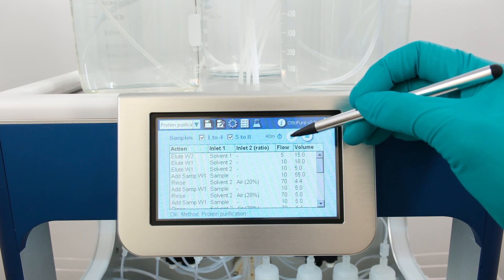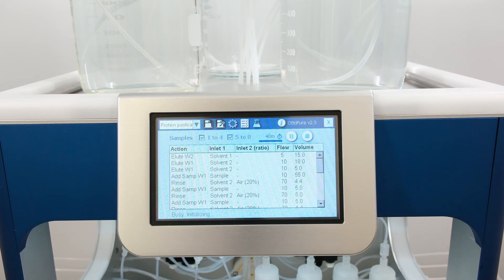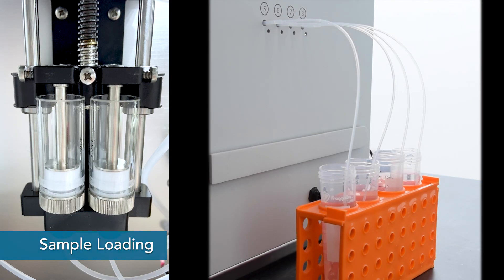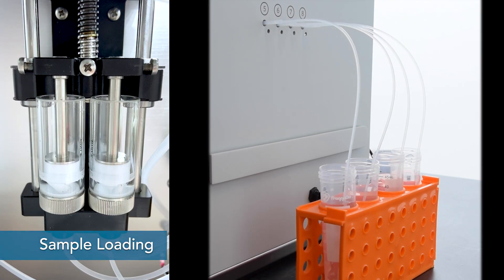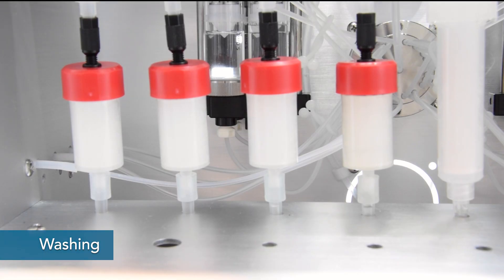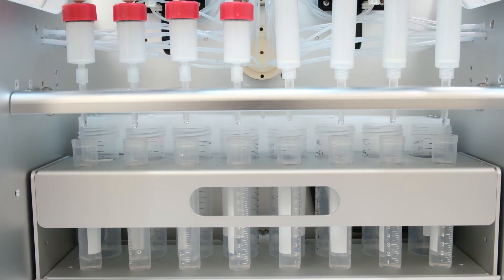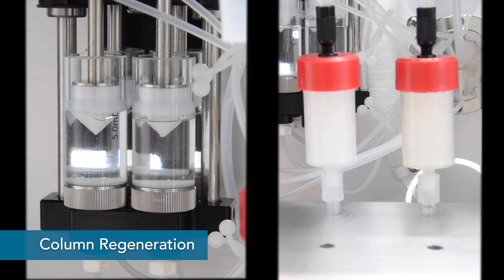After pushing start, the system will automate all the purification steps, including equilibration, sample loading, washing, elution, and even column regeneration.